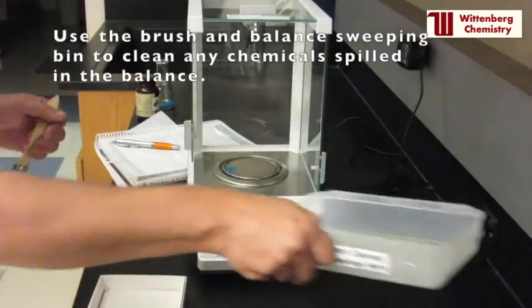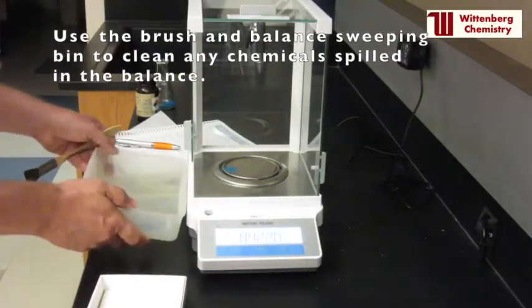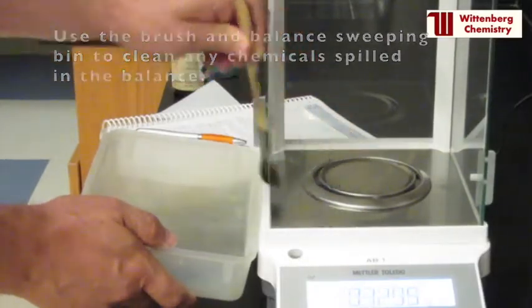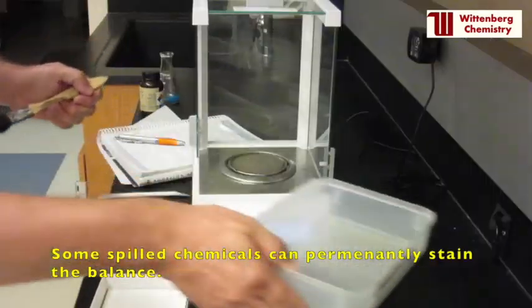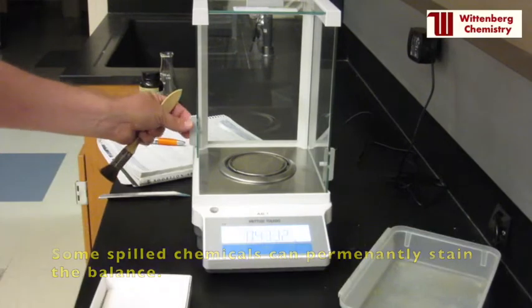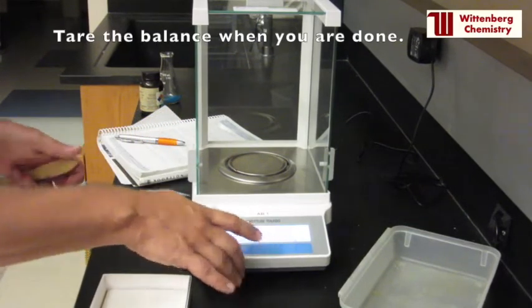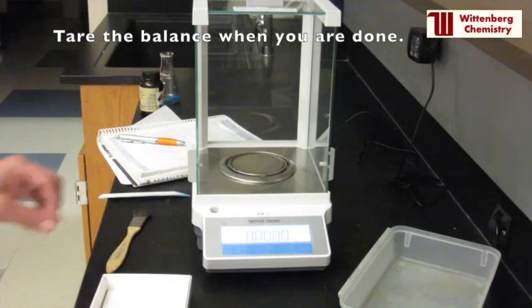If you spilled any solid on the balance, use the brush to sweep it into the sweeping bin. Some reagents can permanently stain the balance. Slide the door closed and tare the balance when you are done.